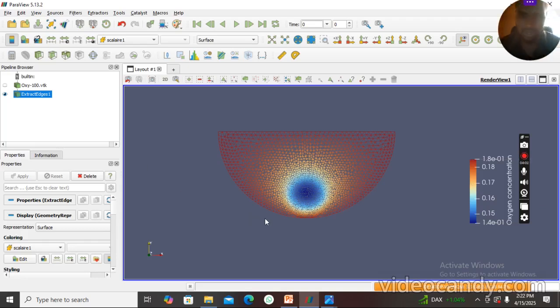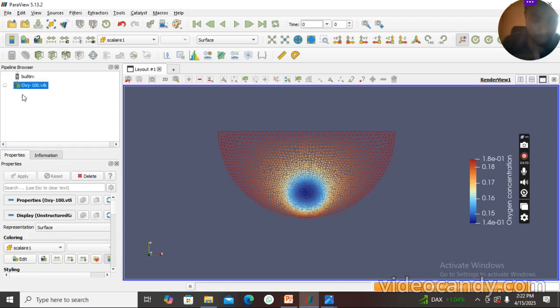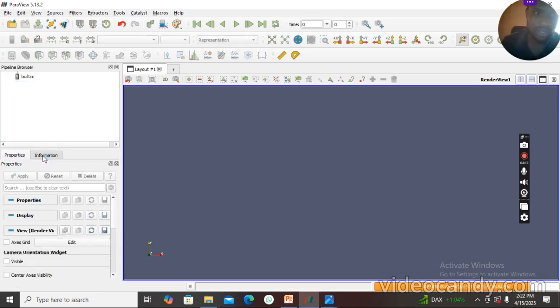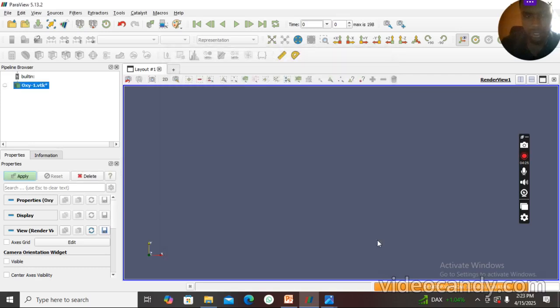So now I'm going to show you how to analyze using a group of data points instead of one, and it is still the same. I import. This time I'm going to import it as a group, and you can see the difference there. It is the asterisk.